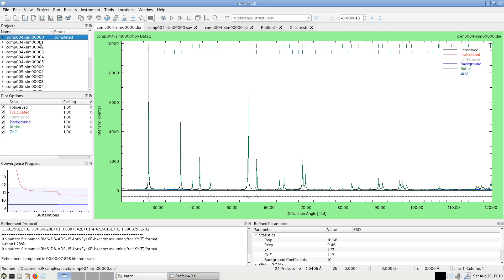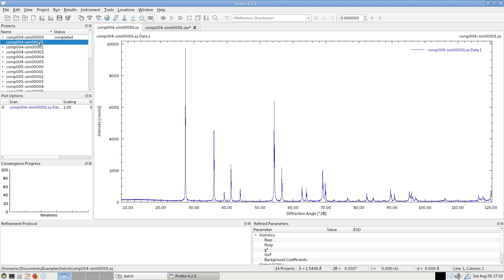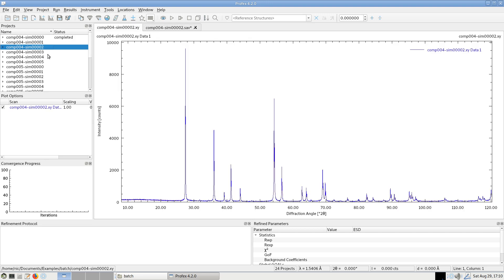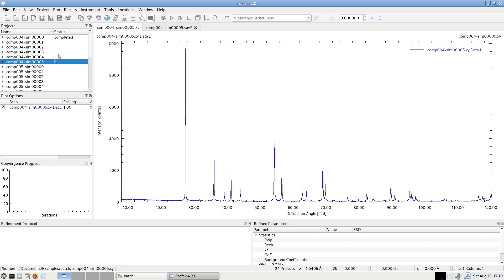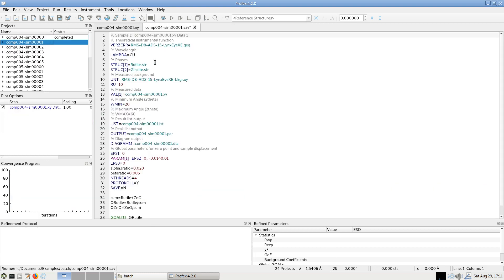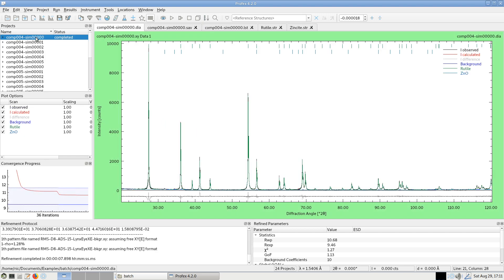And now if I raise one of the other projects, you will see that there is a refinement control file for all of them. And it's exactly the same control file as I created here, just with adapted file names for input and output files.